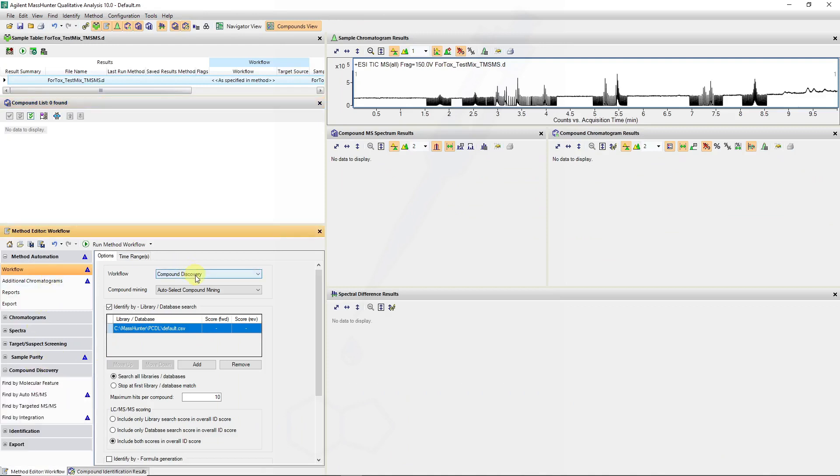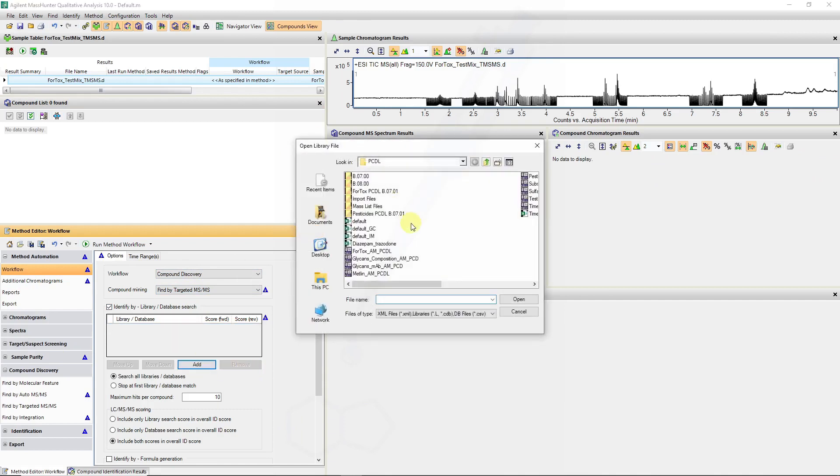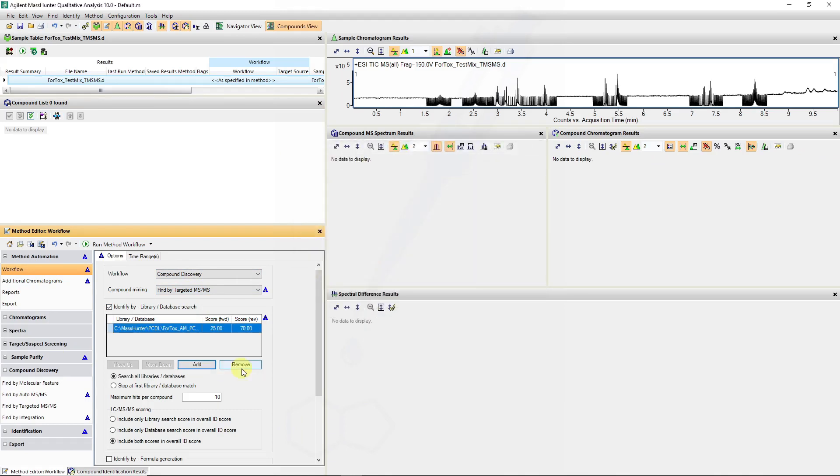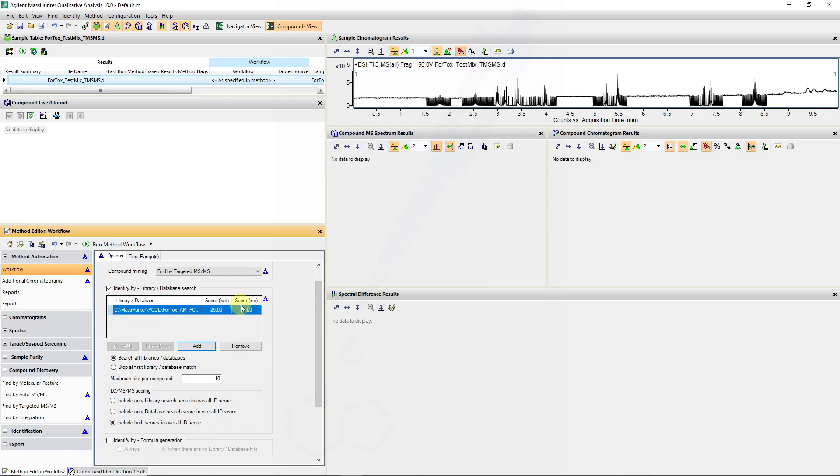Run my compound discovery for targeted MS-MS, remove the database and add a forensics toxicology database, and my forward and reverse scoring I will keep as default.